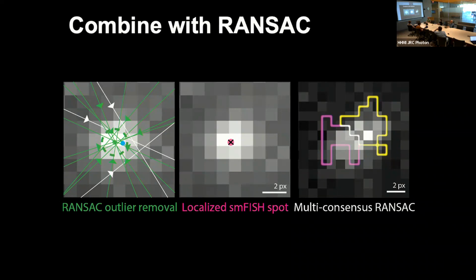To be honest, you need to tune parameters, and this is hard. It's not something that people actually do. And there are better methods if you have a really crowded space. These days you would use machine learning based methods, and I will show one quickly, how I would actually do this. It's a little bit better for crowded spaces.